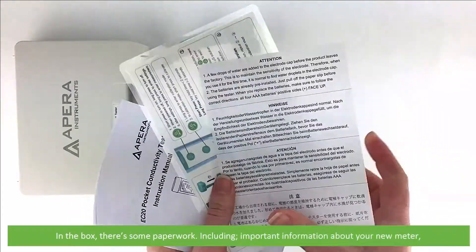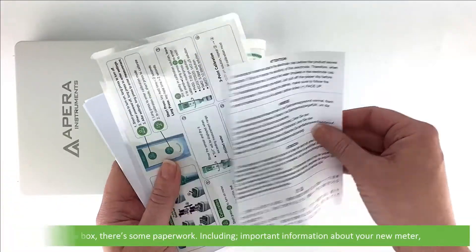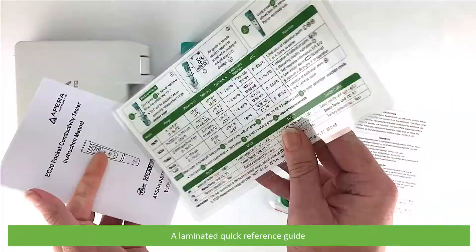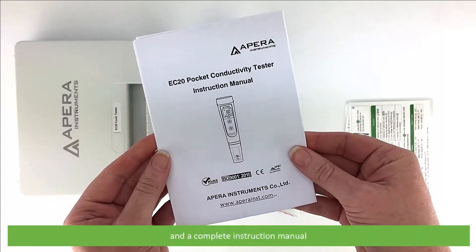In the box there's some paperwork including important information about your new meter, a laminated quick reference guide, and a complete instruction manual.